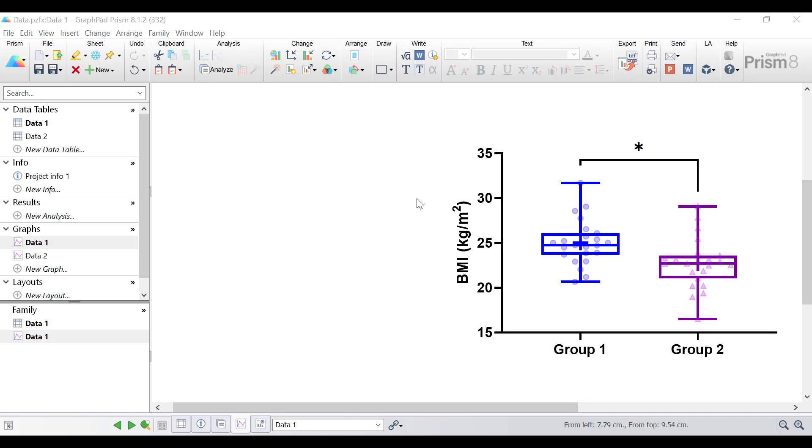Hello, my name is Dr. Stephen Bradburn from toptipbio.com and in this quick tip video tutorial you will learn how to change the global settings of a graph within Prism.